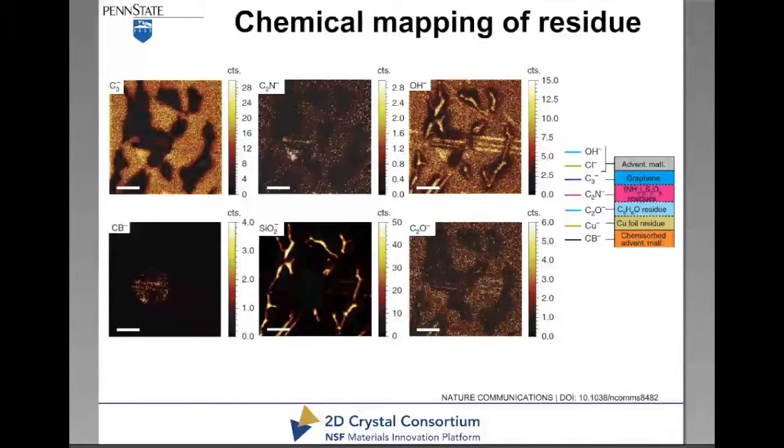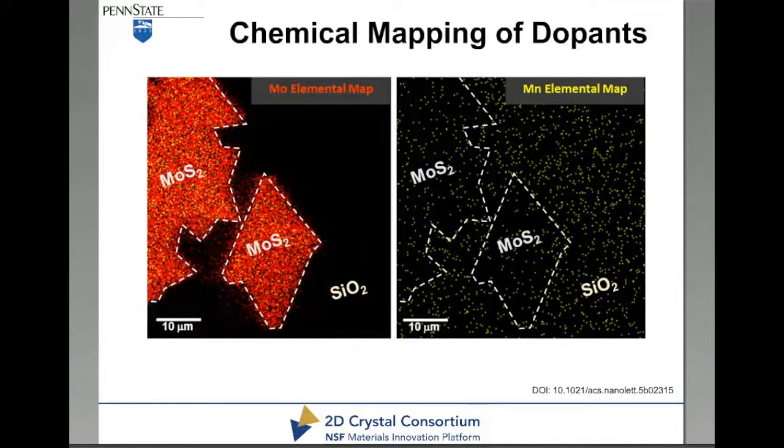And I'm showing in the bottom right here this little Evans Analytical chart. It's this big red bubble there that the yellow arrow is pointing into. So it can go to very high sensitivities and very small spot size. It's quite useful for mapping chemical residue for things like transferred graphene or transferred 2D materials, right? So in this particular case, this is an example from the literature out of UT Austin that looked specifically at transferring graphene, CVD graphene, onto other substrates, onto BN, onto SiO2, etc.